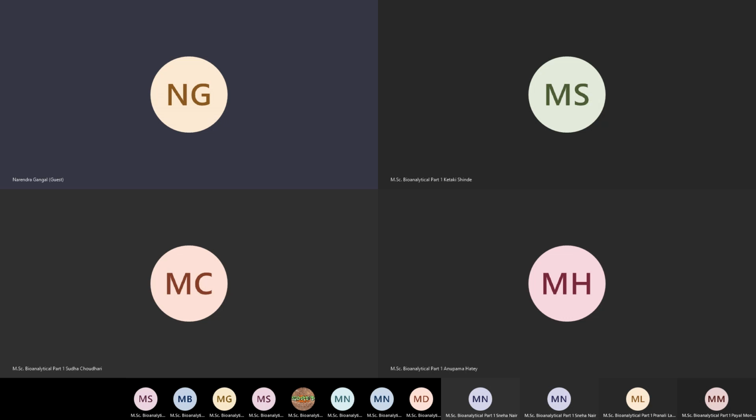That is typically called the molecular ion, which is very critical for me. I definitely want to know the molecular ion, because in the mass spec we can see either only the fragments, or the molecular ion. Without the molecular ion, only with the help of fragments, I won't be able to elucidate the structure. So we will always need both: fragments and the molecular ion.